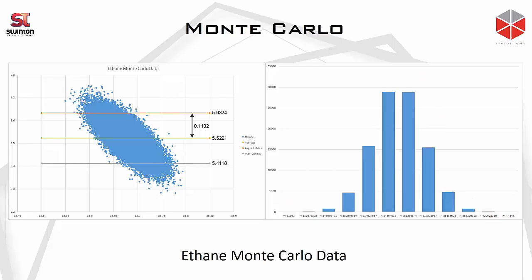This two standard deviation here is taken from the actual uncertainty that we see on that individual component, so we generate the numbers with this two standard deviation, and the distribution is a normal distribution. We generate this for every single gas, 100,000 data points for every gas, and we put a combination of all these inputs together and calculate the output.